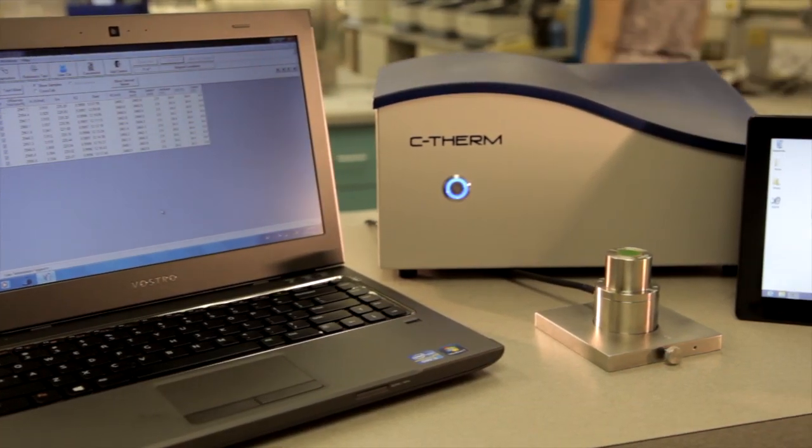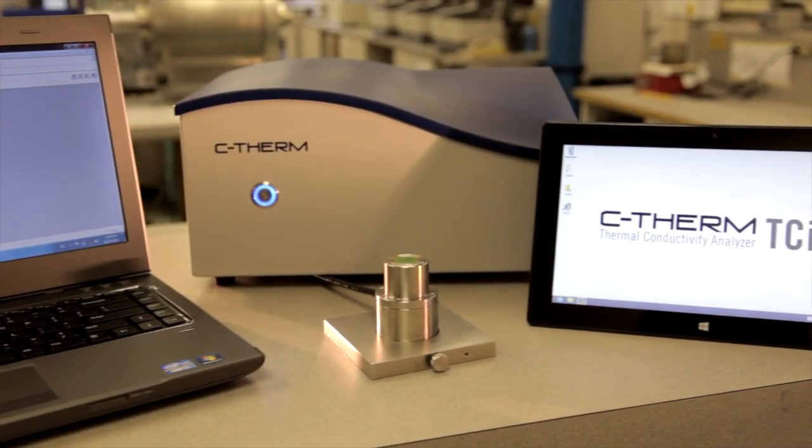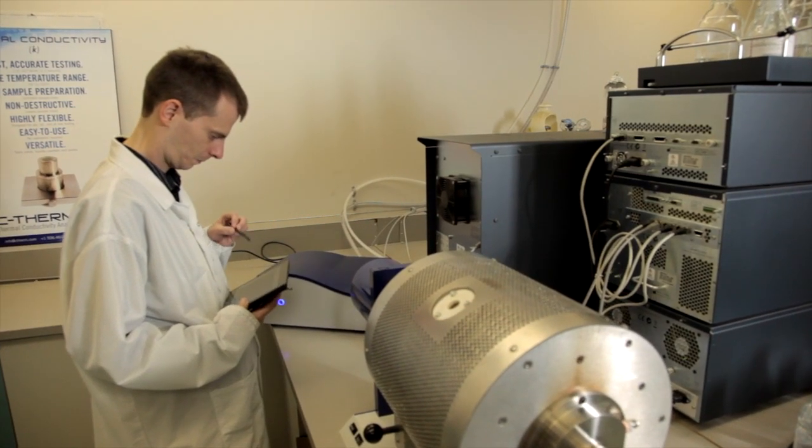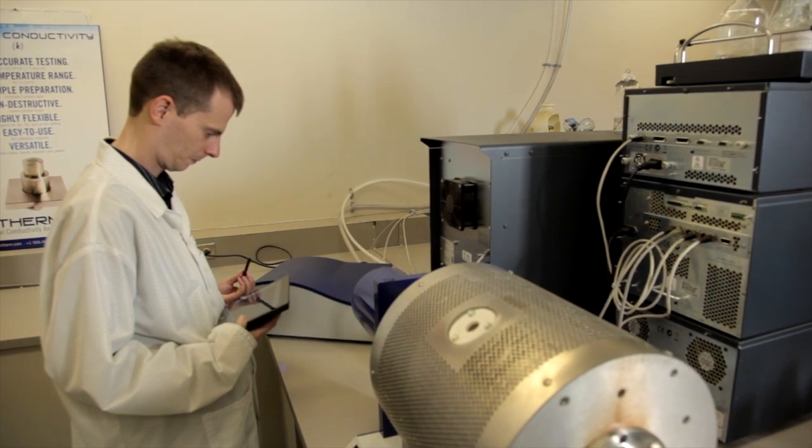The TCI system is configured with a laptop computer or tablet that displays test results in real-time. There's even a wireless tethering option for remote monitoring and instrument control.